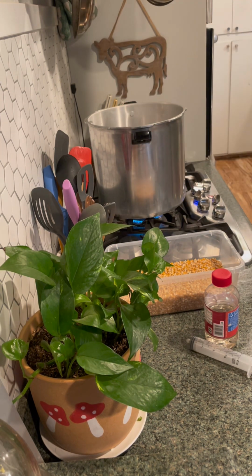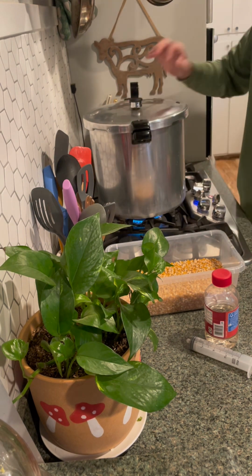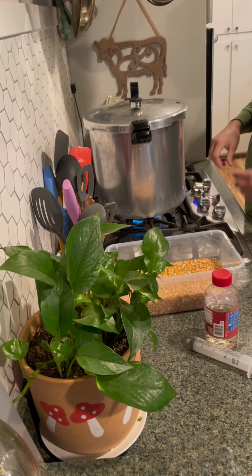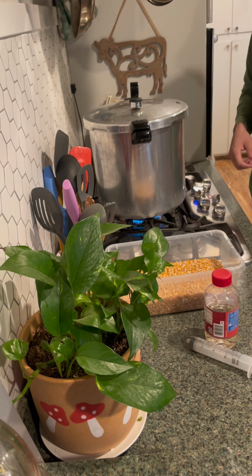I put it almost all the way on high. Put the lid on, and I already have the weight on there. So I'll let it go to where it starts rocking. As soon as it starts rocking, I'll turn the temp down, and right then I'll set my timer for 30 minutes. At 30 minutes, I'll turn it off and strain it out.